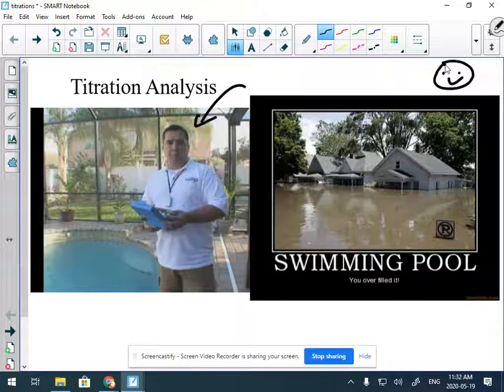Things like dissolved solids or like ionic substances that were dissolved, because if it gets too high, it can wreck the pipes. Chlorine levels, because chlorine is what oxidized germs and bacteria. And pH. Well, pH, you could just put a couple drops in to get pH. But there was two things that we had to do, and they were like little mini titrations.